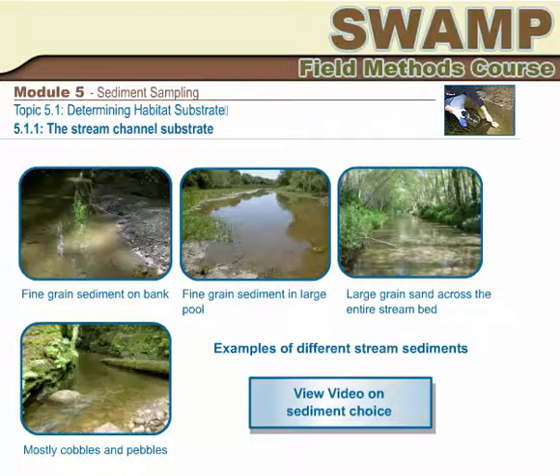Avoid sand, hard clay, bank deposits, gravel, disturbed or filled areas. Any sediment that resists being scooped is probably not recently deposited fine sediment material. In following this guidance, the collection of sediment is purposefully being biased for fine materials. This must be discussed thoroughly in any subsequent interpretive reporting of the data in regards to representation of the collected sample to the environment from which it was collected.